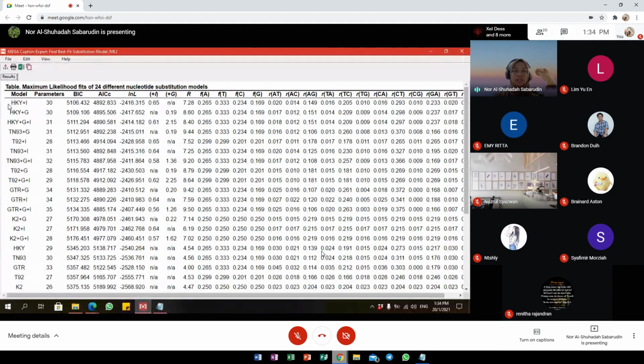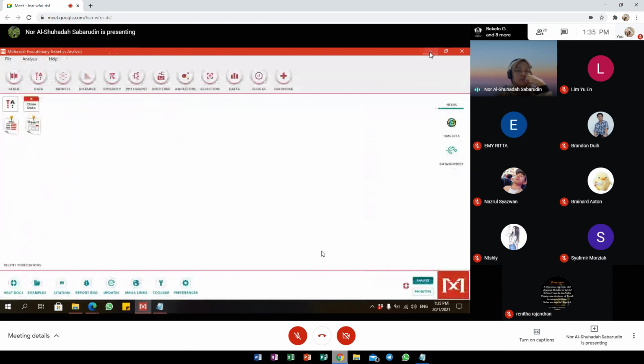But if there is no option for the first one, you can choose the other one. If there's no option for the second one, then you choose the third one, and also the fourth one, like that. Later on, I will show you which one we will choose.